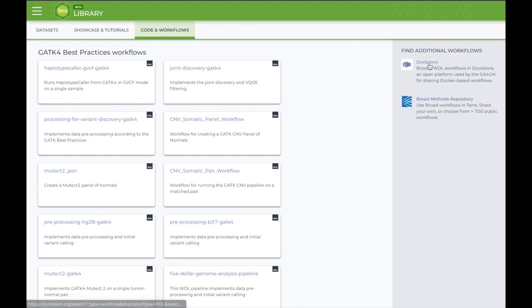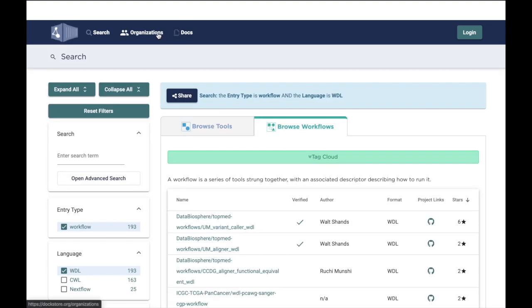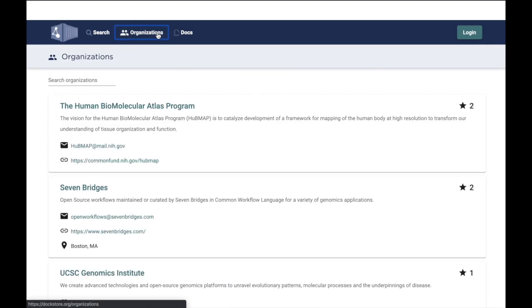For example, if you visit the Doc Store, you can find workflows created by any number of organizations by clicking on this link here.